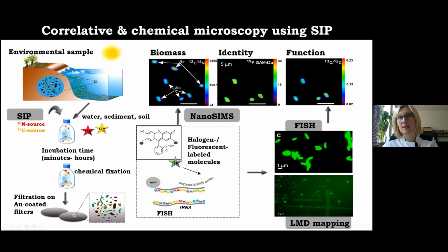In this case, it was uptake of 13C-labeled glucose. It can be any type of substrate. It is important that this substrate stays in the cell. If it is respired and it's outside the cell, then you cannot say anything about this process.